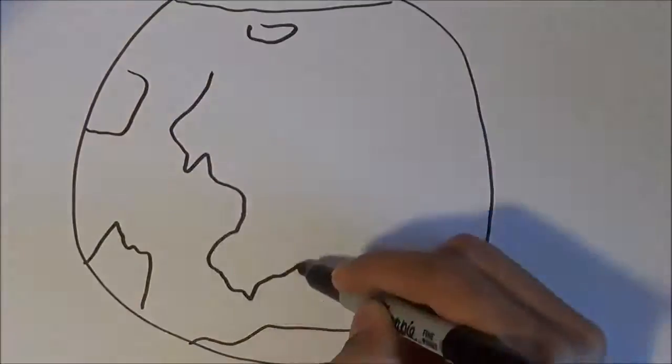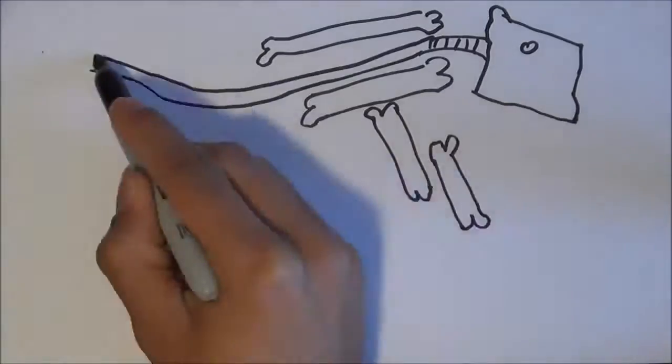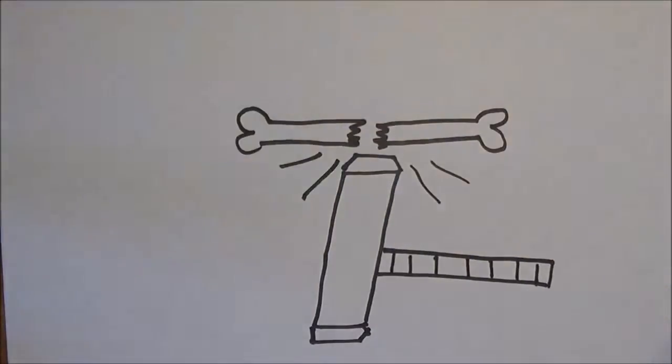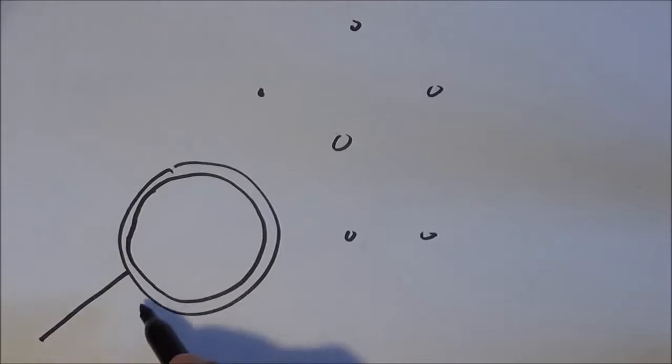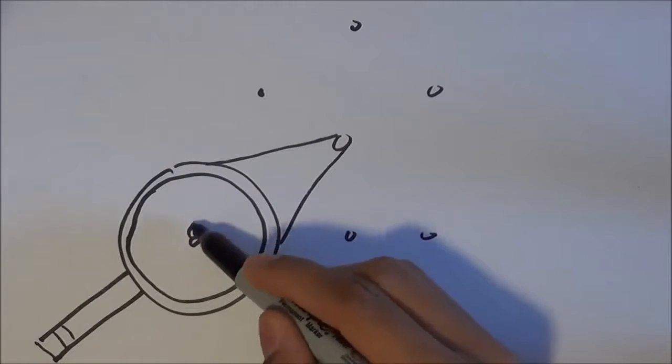Our world is incredibly big, with really heavy objects and complex forces. But everything can be broken down into incredibly small pieces called atoms and molecules, and even smaller pieces called protons, electrons, and neutrons. Even though we can't see some of these particles, they still have masses. But how do we measure them?